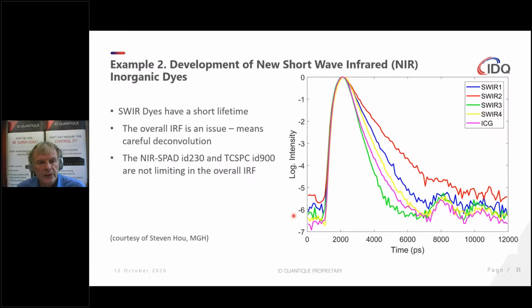On the next slide, I give you another example of fluorescence detection in the infrared. Many people are developing new dyes for the infrared, for microscopy and for cuvette measurements, because more and more people want to go into redder wavelengths. Lower energy will cause less damage to your sample, especially if it's a biological sample, and you can also penetrate deeper in opaque or turbid media.